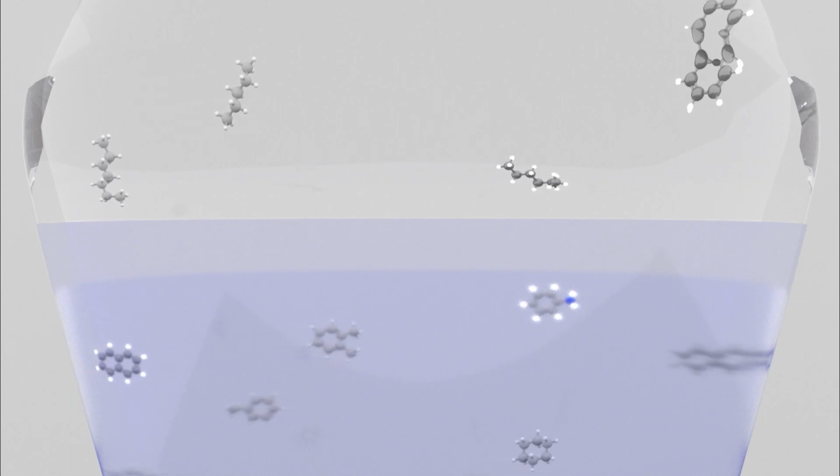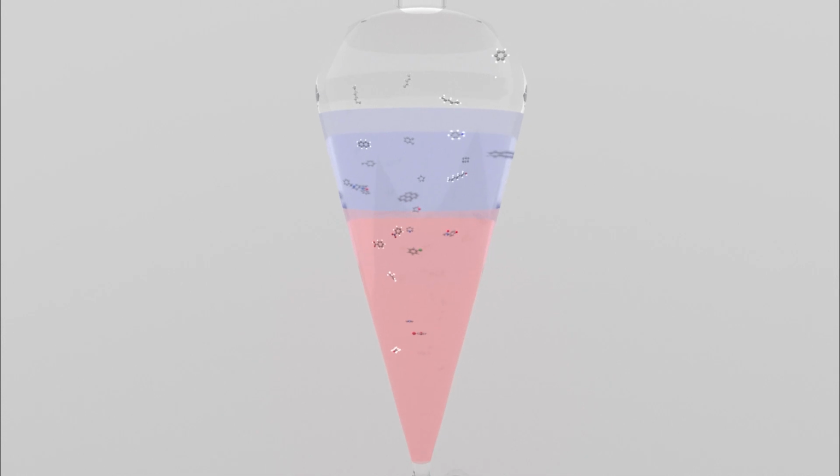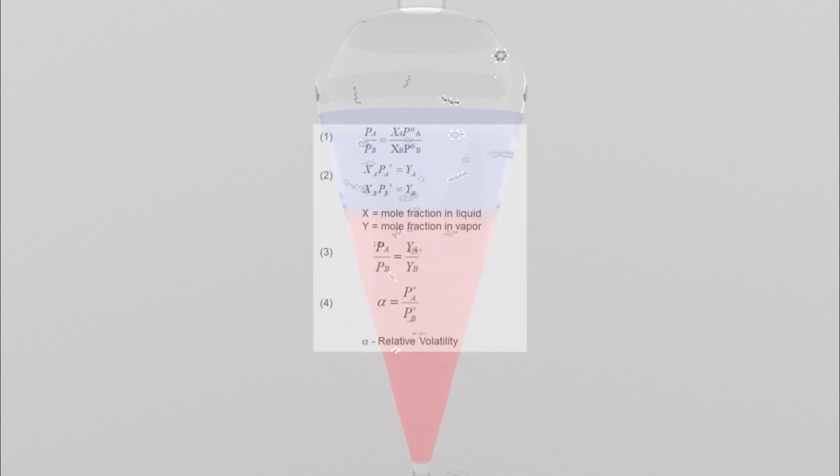At its core, chromatography is about using the difference in the physical characteristics of components in a mixture to separate, identify, and if needed, quantify the individual components. High-performance liquid chromatography, like here in the separatory funnel example, uses liquid partition coefficients to accomplish the desired separations.